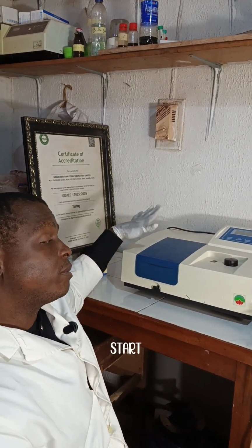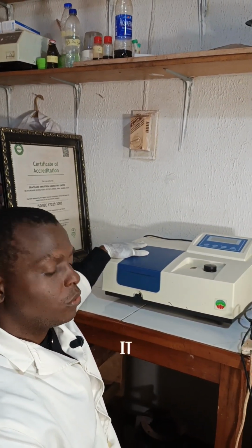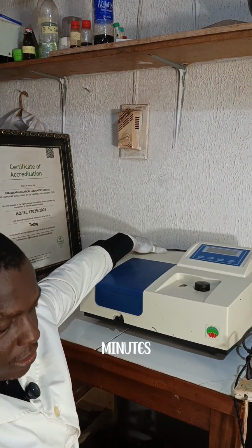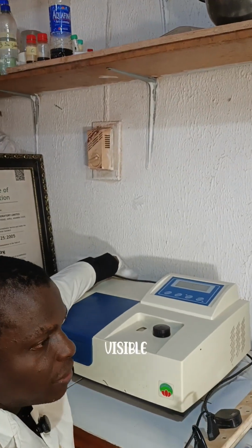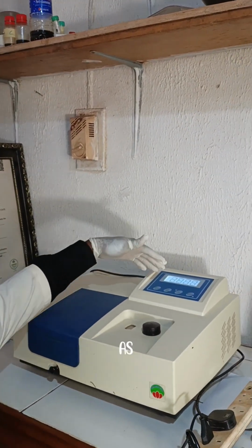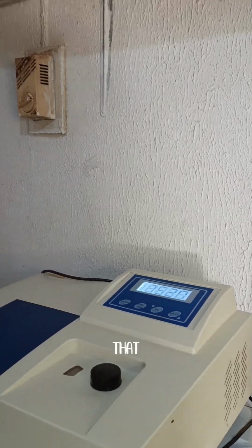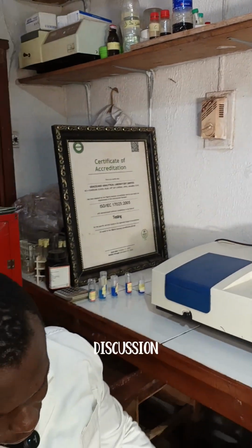In order for us to start, because anytime you operate a spectrophotometer, you will have to allow it to warm up for at least 30 minutes. So therefore, I want to turn the UV visible spectrophotometer on. As you can see, it is on now. So the next is that we'll continue with our discussion.